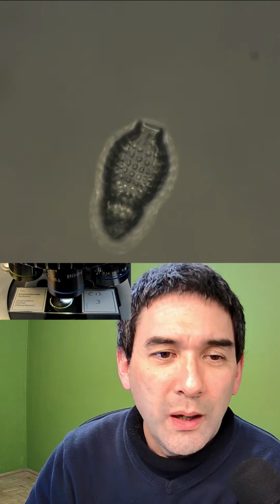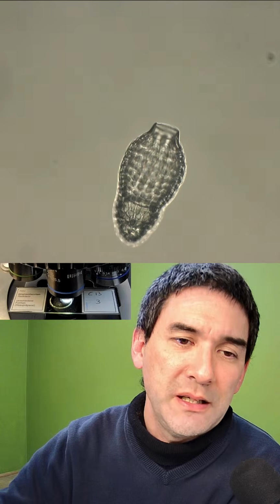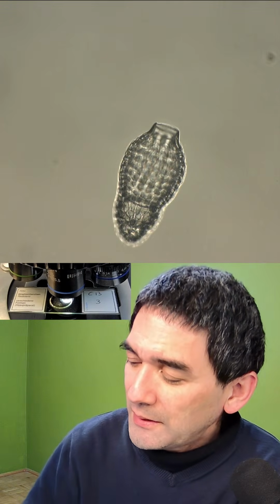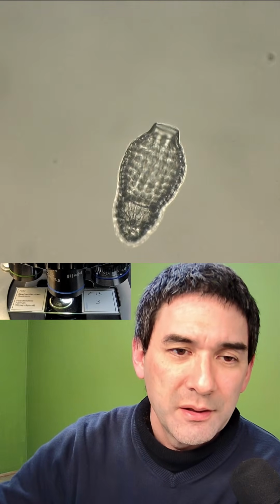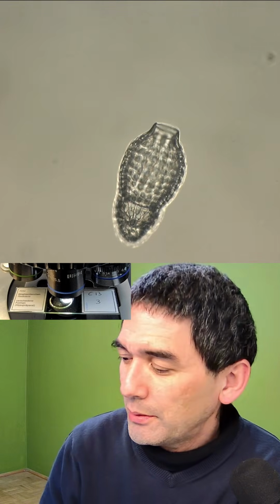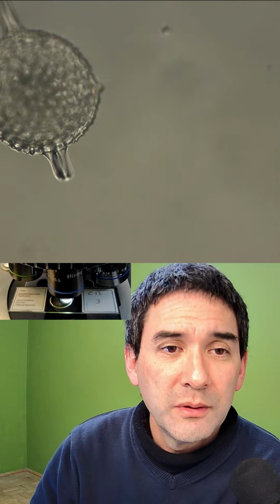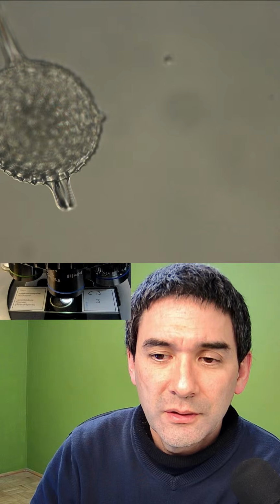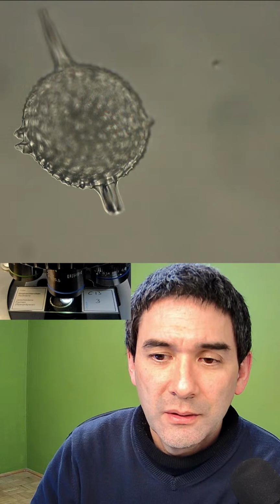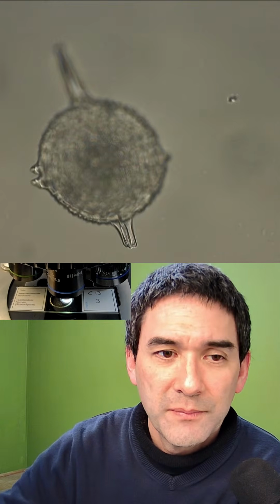If you wonder why sometimes the brightness jumps so abruptly, it is because I try to pre-program the intensity setting of the lamp of my microscope, but sometimes it starts to jump. So that's essentially the different shapes that you've got here. Okay, here we go. So look at this here.